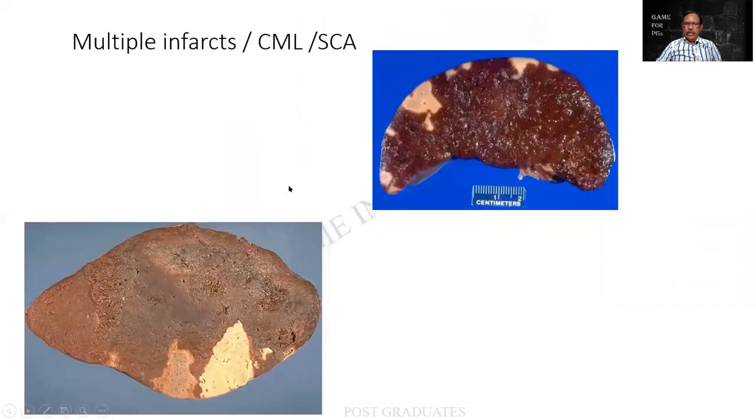Geographic infarct is somewhat different. Look at this. Again, multiple infarcts are there. So the patient is having repeated obstruction. It can be because of lymphomata, or it can be because of metastatic deposits, or sometimes very frequently in a case of a sickle cell anemia. That is why there is a repeated infarction, and it will be going in for an autosplenectomy. So these are the different types.